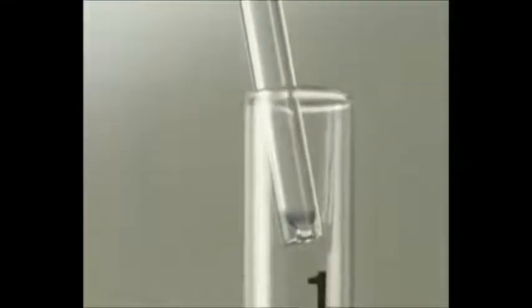The hydrocarbons which boil at this temperature drip down the sidearm and form our first fraction. It's a colourless liquid. The temperature stays at around 40 until all the hydrocarbons with this boiling point have vaporised. The hydrocarbons left behind aren't hot enough to vaporise. Their boiling points must be higher.